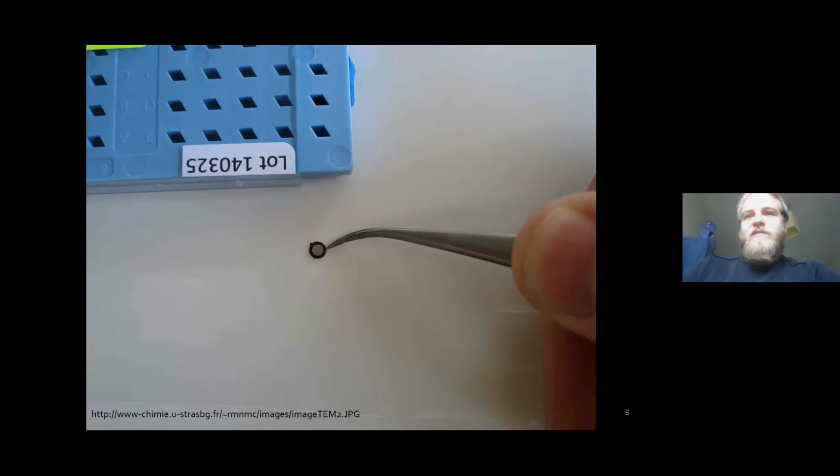I always thought it's quite funny that the electron microscopes are such big instruments, because this is what we're looking at. Maybe 3 millimeters across is a TEM grid. And this is where we need to put everything that we look at. So you can see we're not actually probing a whole lot of material, which is obviously one of the issues with TEM in particular, is that we're only seeing very, very small amounts of material at a time. So we need to generalize quite a bit.